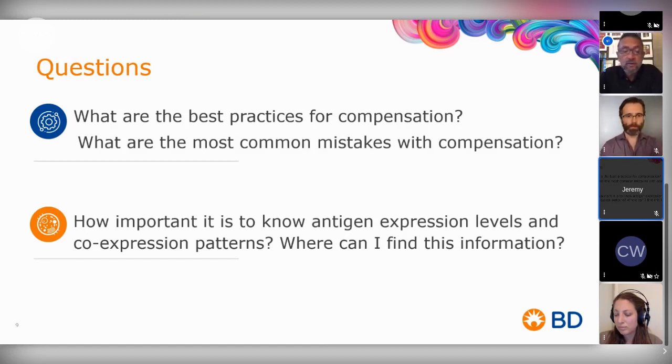I worked with Hervé Luge, also Bernard Mallison and Marie Mallison and their team, and we built a similar model for mice. We took one mouse strain, but we did the work a little bit differently. We borrowed the knowledge from everything we did from the human perspective. We examined all the different cell surface receptor antibodies that were available across multiple companies.